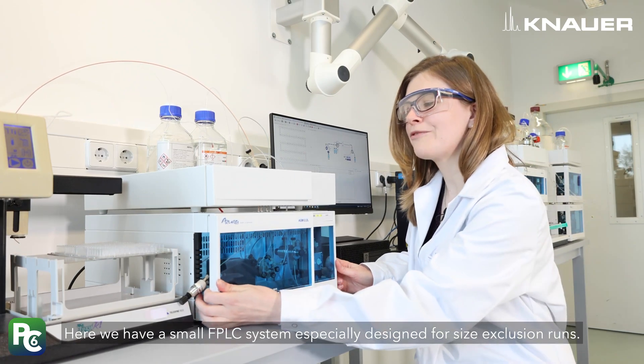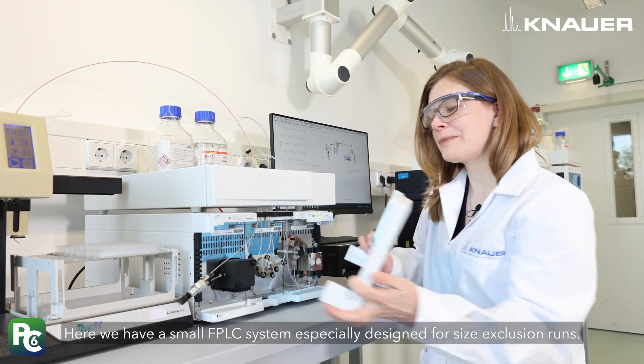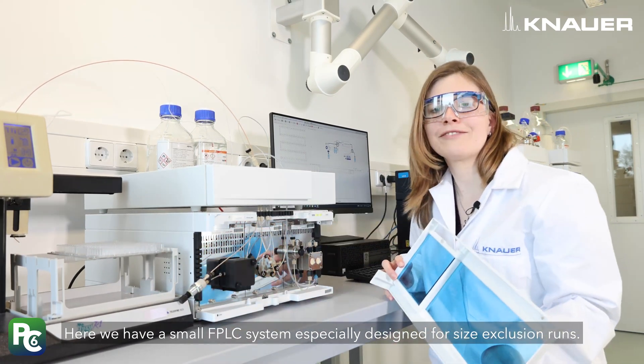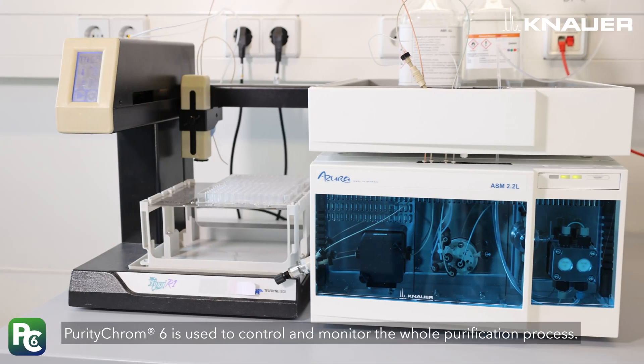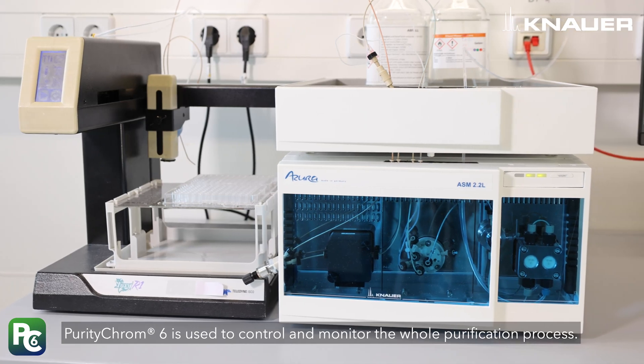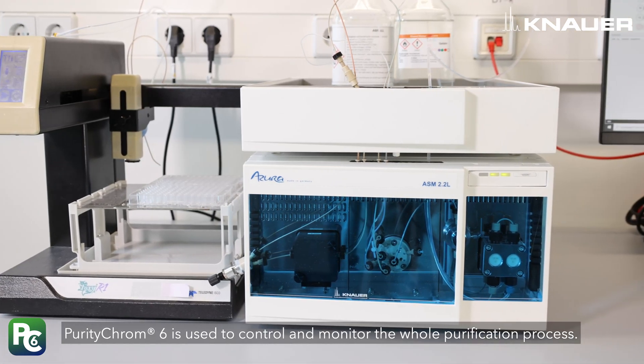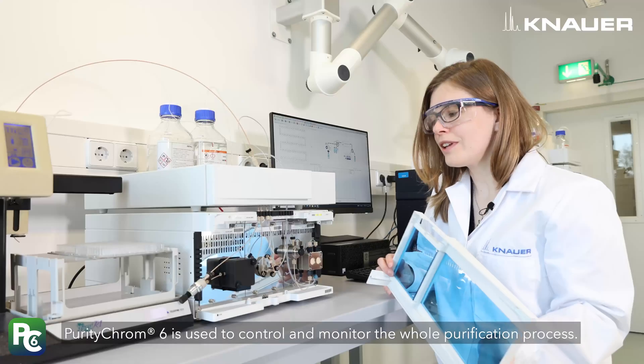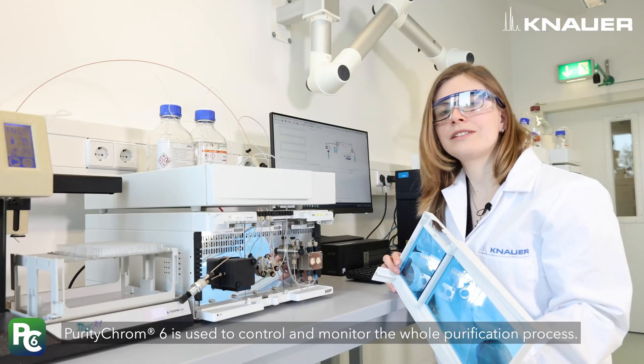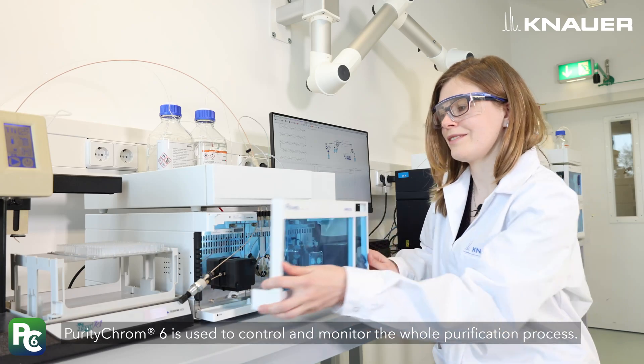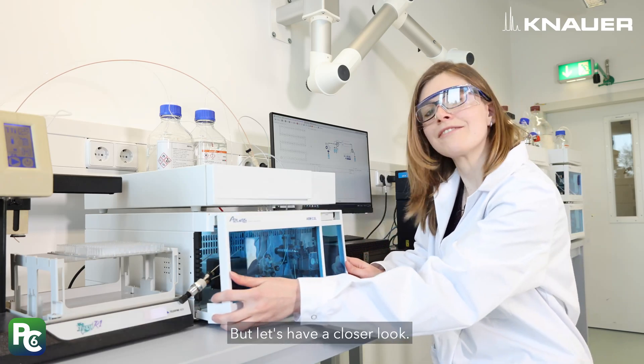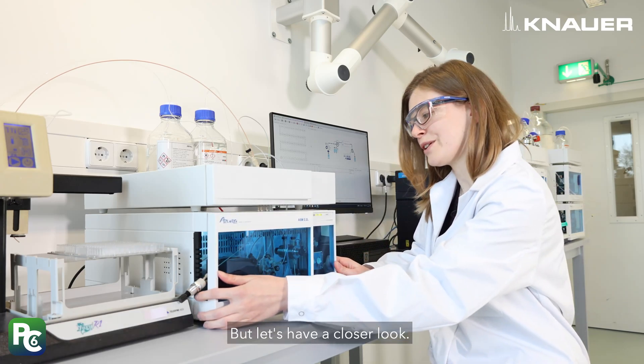Here we have a small FPLC system, especially designed for size exclusion runs. PurityChrom 6 is used to control and monitor the whole purification process. But let's have a closer look.